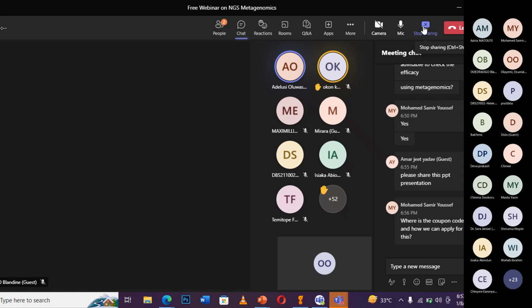Okay, so I think I understand your question. What I'm trying to say in essence is that you can actually know specific genes associated with a particular bacteria of interest when you are exploring AMR or virulence genes in metagenomics.